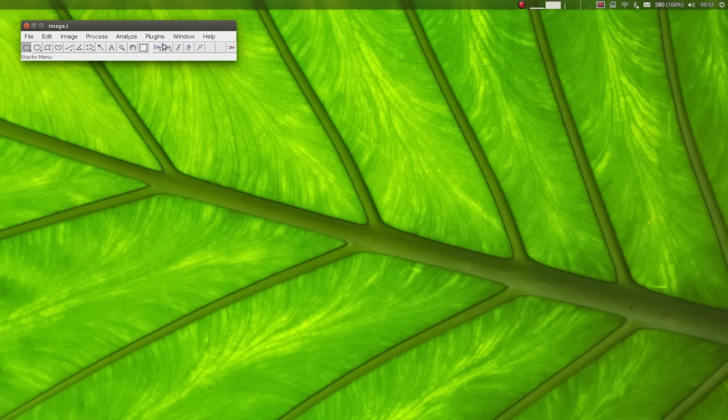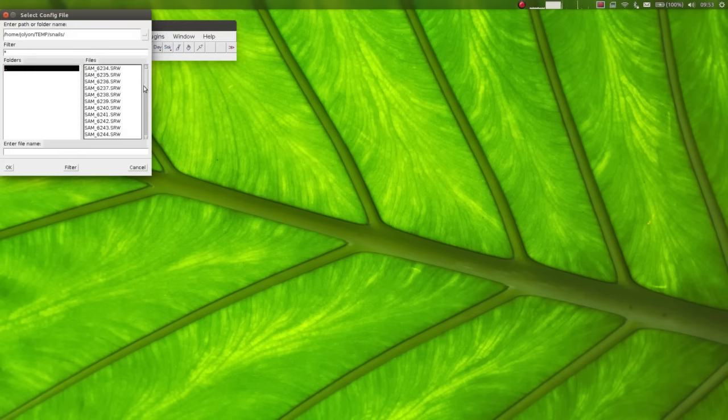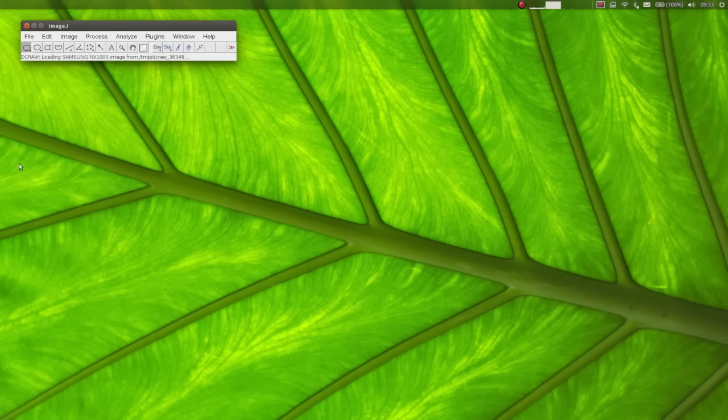Next, let's just open up one of the snail images and measure the size of the snail. So we're going to be measuring the pattern of the snail, but we don't want to measure patterns that are larger than the snail itself. Obviously, that wouldn't make sense.